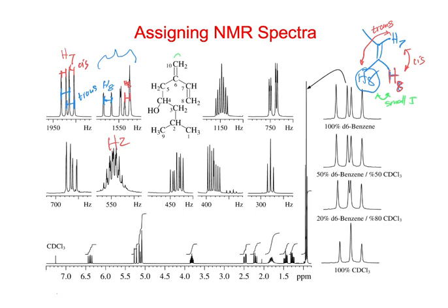So what I would say is that this is probably then an H10 here, and there's another H10 there, which the red H8 is overlapping with.